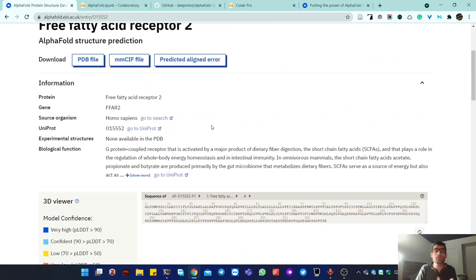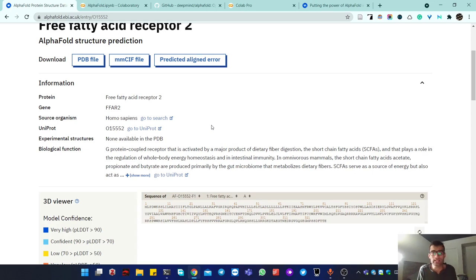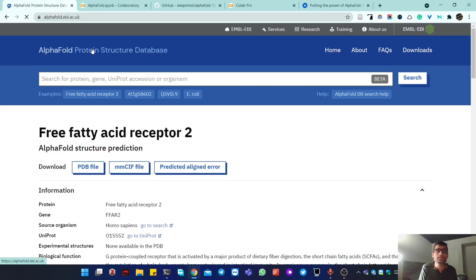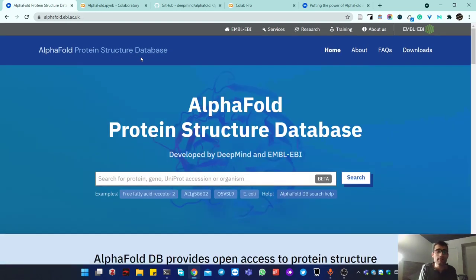The problem is that sometimes — in my case — I'm trying to add a linker to a protein, fuse two proteins, or work with a protein from an organism that's not one of these 20 supported ones. In that case, I can't access it from the AlphaFold Protein Structure Database.